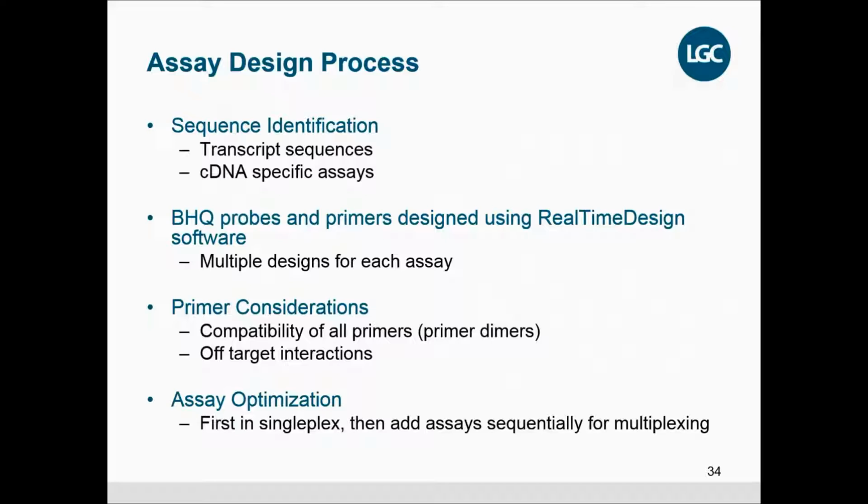Primer considerations. Primers are one of the more important things. We need to understand if the primers that we're going to use, especially when we're multiplexing, are compatible with each other. So are we forming primer dimers with other assays or within an assay? And there are several software programs available to assist with this.